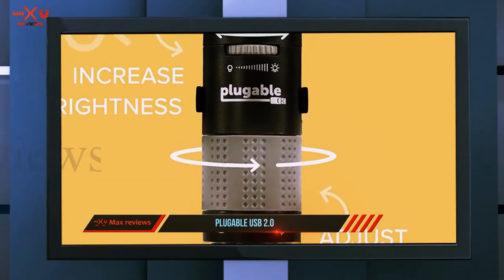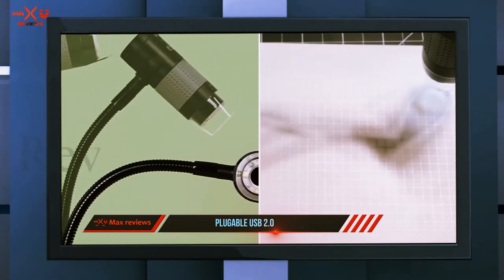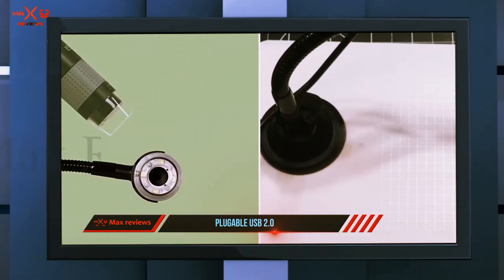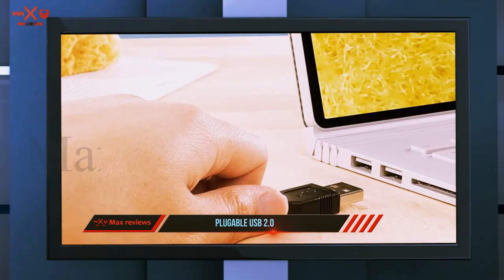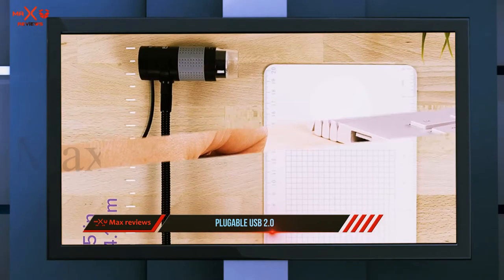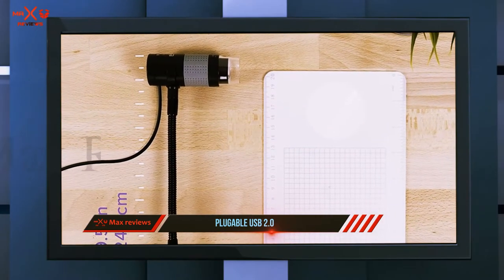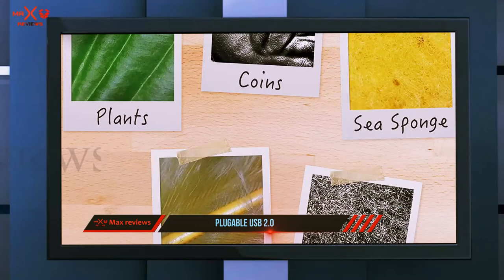One reviewer says the magnification is incredible: 'I bought this to be able to zoom in on insect and tarantula exoskeletons to better determine the sex of the animals I own, and this can go so much further. I started zooming in on everything nearby. It can zoom so far in that you can get to the point where only three to five ridges from your fingerprint will fit on the screen.'